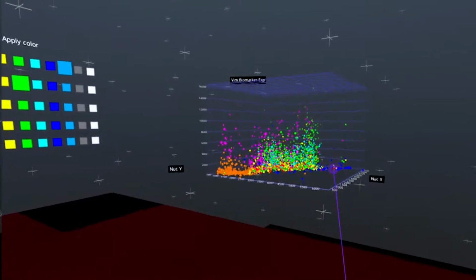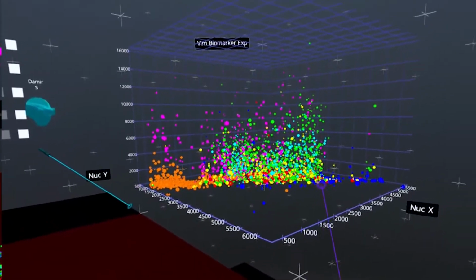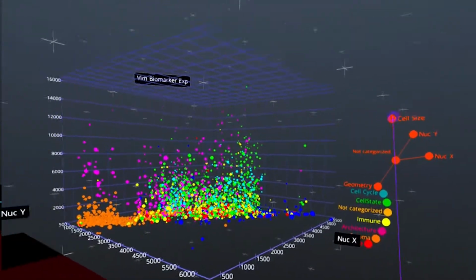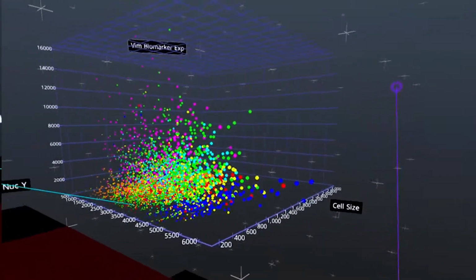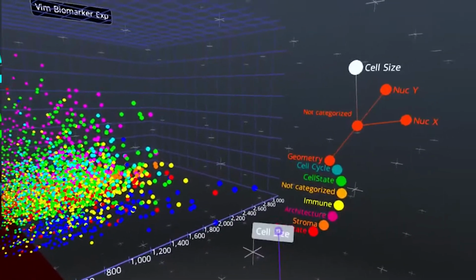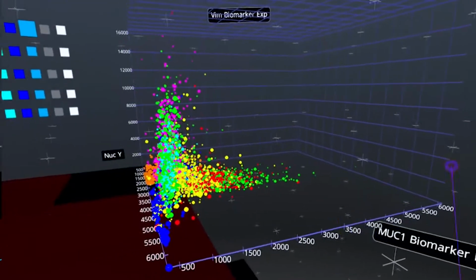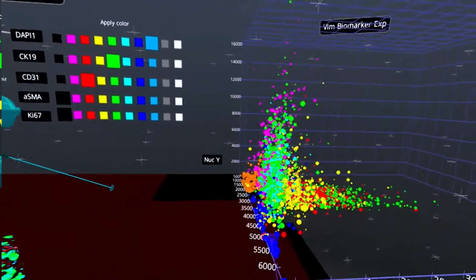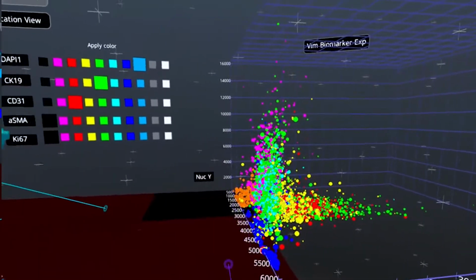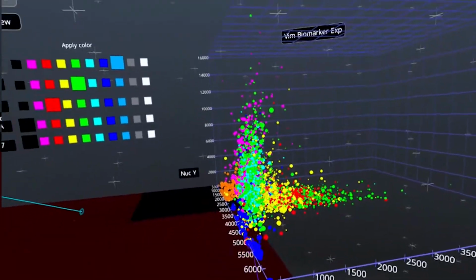And then finally, on the far side over here, we also have an additional scatter plot of the dots, but each and every one of these axes can be swapped for another valuable informational visualization, taking a look at different cell states, etc. So the researcher can combine 3 different axes, 3 different properties together to see relationships between them.